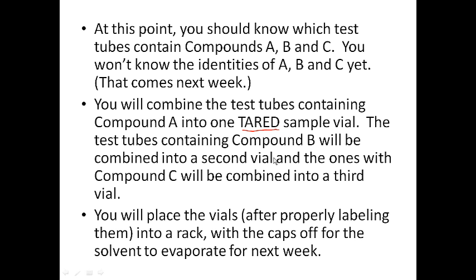Now we could rotary evaporate the sample vials to get the powders, but to be honest with you, there's really no rush to do that.